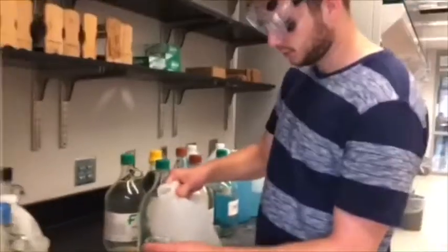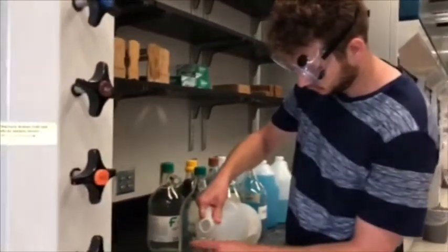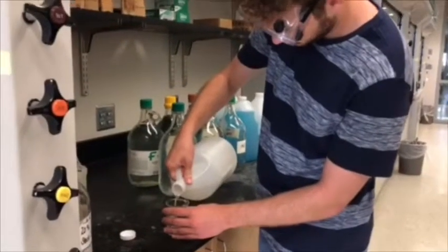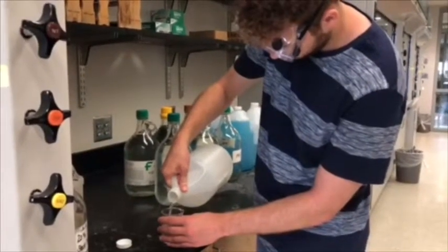For exercise 2, we had to find the density of sugar solutions and find the relationship between the density and the concentration of sugar in each sample. We transferred some of the sugar stock solution into a clean, empty beaker.